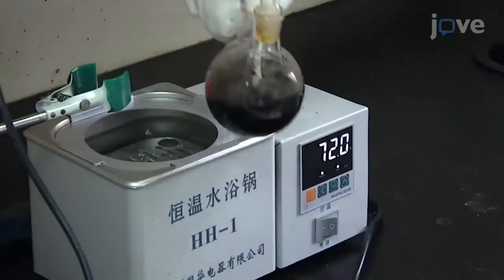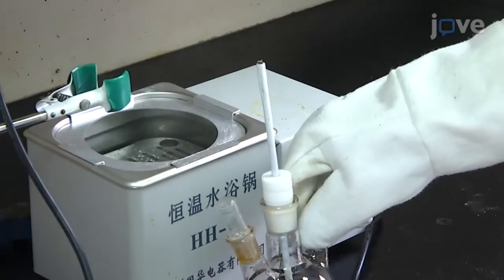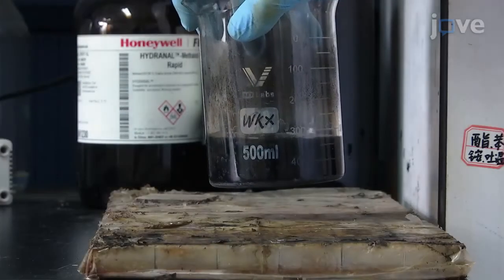At the end of the incubation, cool the resulting solution to room temperature, and precipitate the mixture via magnetic separation according to standards.